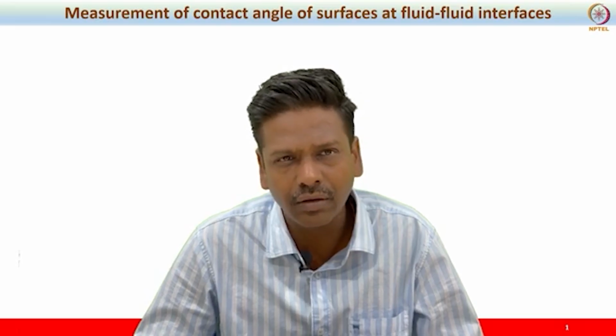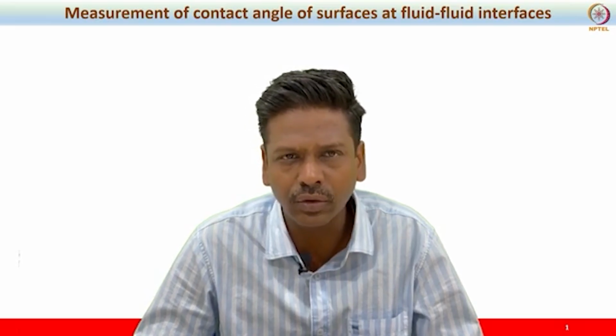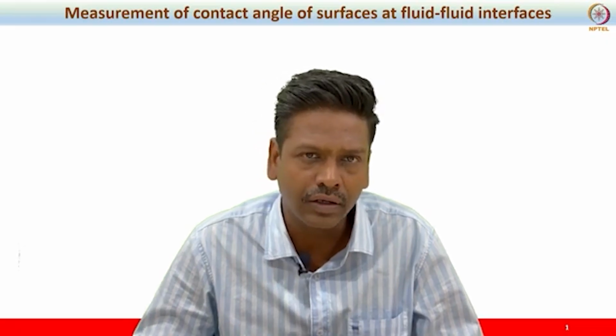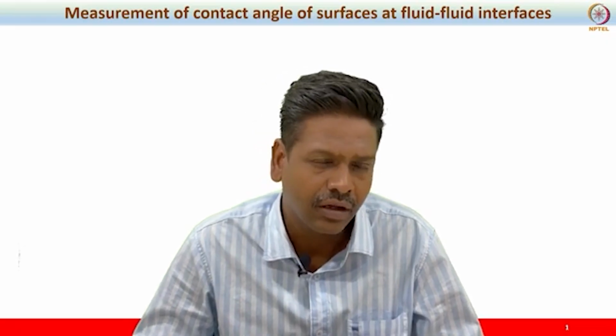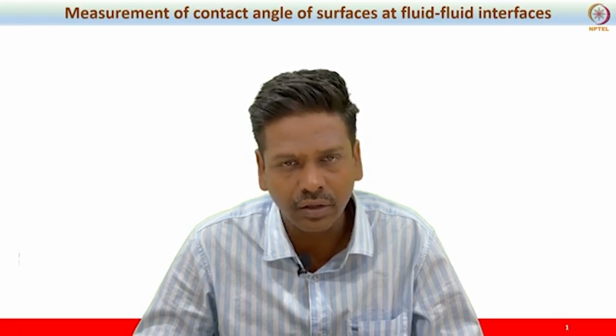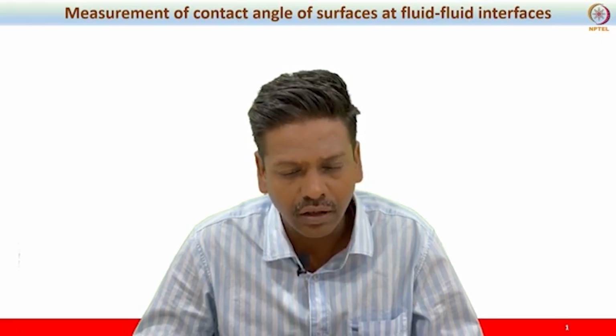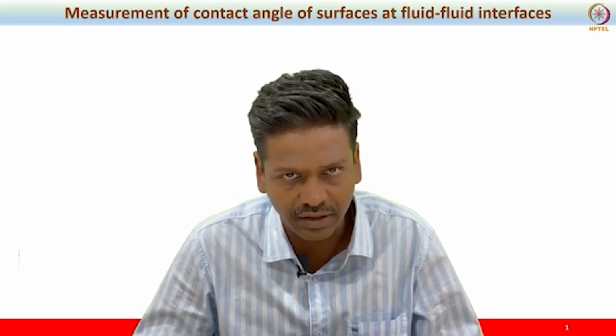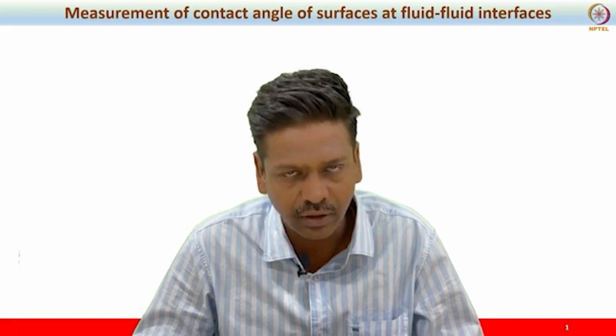This is important when we deal with formulations, emulsions, foam, and in those applications, the measurement of theta is going to be very important. We will look at for such a case how we can measure the theta, the three-phase contact angle. Let's begin our lecture.